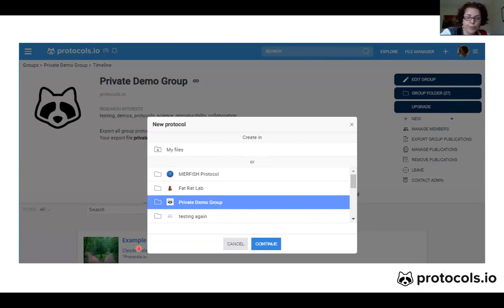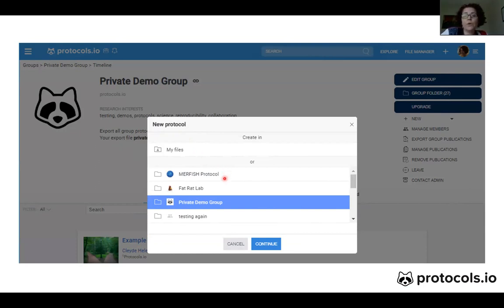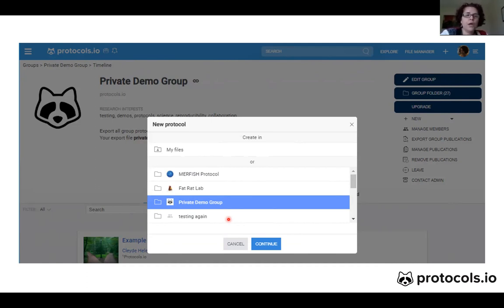After you create your private group, every time that you create a new protocol you will have the option to either add it to your personal files — where you are the only one who can access and see it — or you can create the protocol in one of the groups that you are a member of, and then all the members and only the members of that private group will be able to see it.